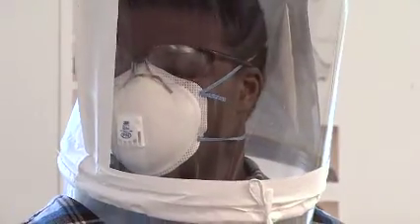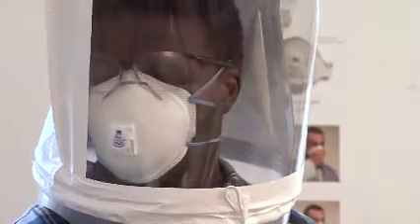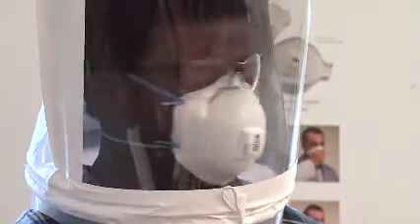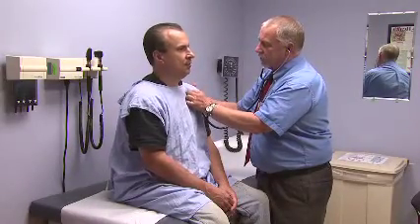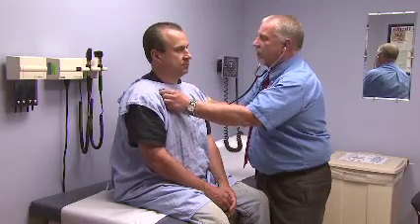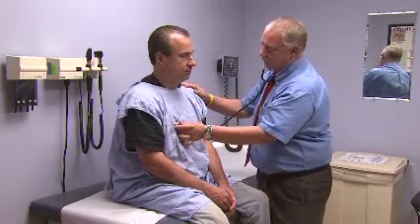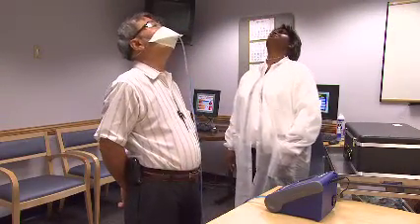Your employer does this by performing a fit test on you while you wear the same make, model, and size of respirator that you will be using on the job. That way, you know that your respirator fits you properly and can protect you as long as you use it correctly. In addition, before you use a respirator or are fit tested, your employer must ensure that you are medically able to wear it. So, what is a fit test?